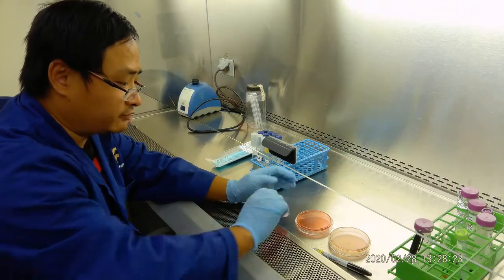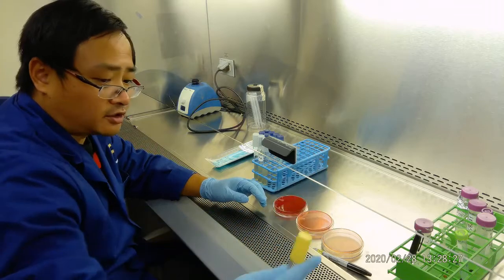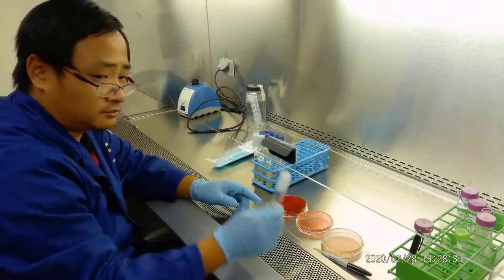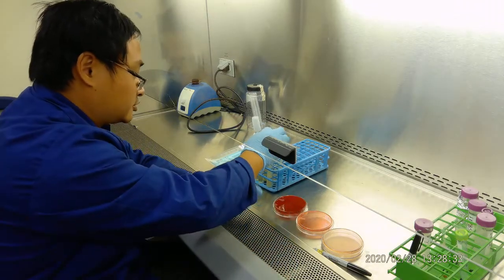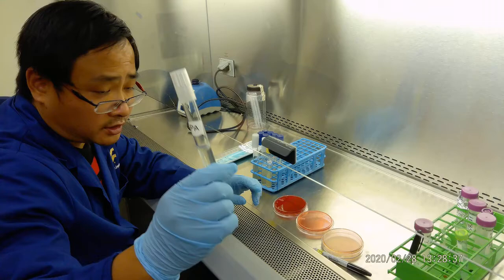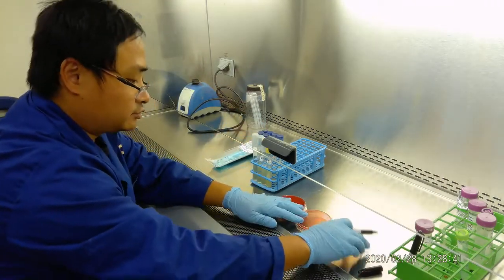So we will do some very easy work right now. We have Staphylococcus aureus, we have E. coli, and we have Pseudomonas. Pseudomonas is right here. So okay, what are we going to do? The first job is we have to label.